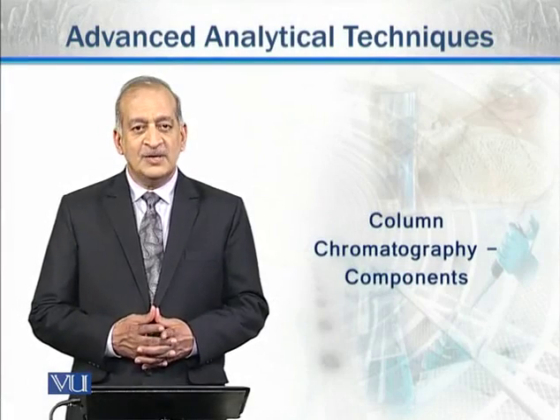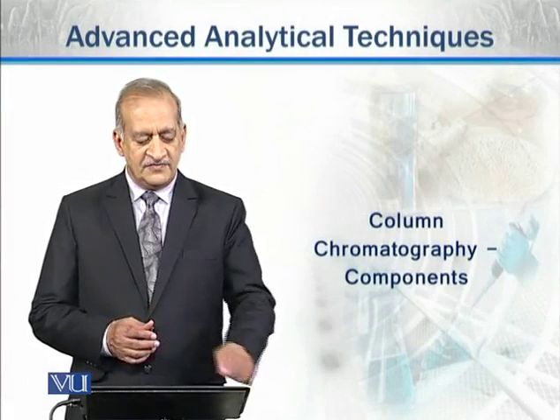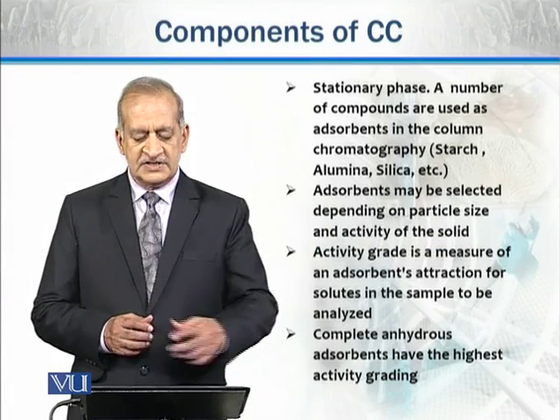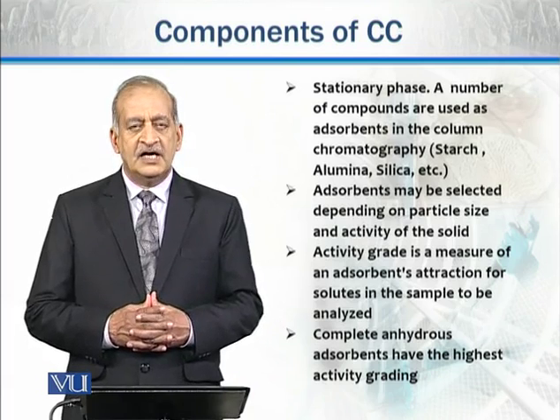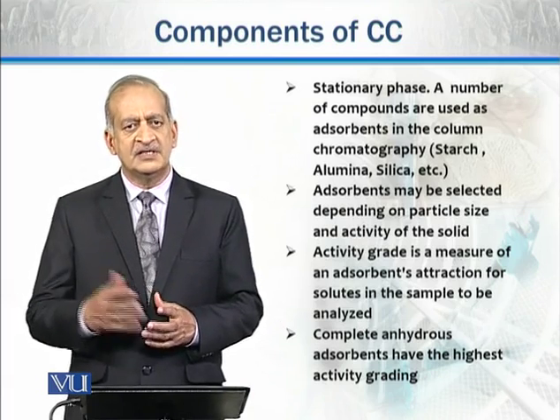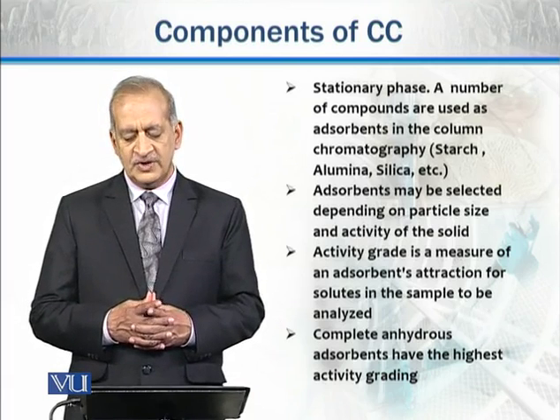Now we'll discuss components of column chromatography. So we'll discuss different components one by one. First of all, stationary phase. Stationary phase, we know, is very important in column chromatography and other types of chromatographic methods as well.